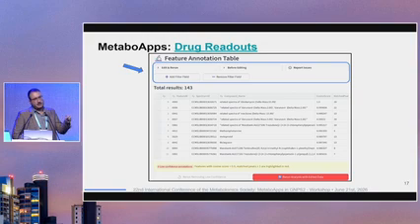But they are not, at least yet, known as human metabolites of those drugs. So you're going to see a similar metabolite, but we don't have information yet. Maybe they're going to move from analogs to being actual metabolites of those parent drugs. That's basically the difference.